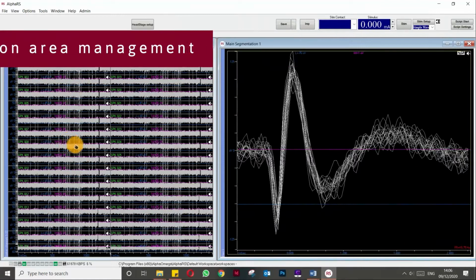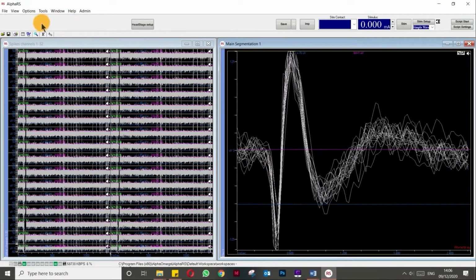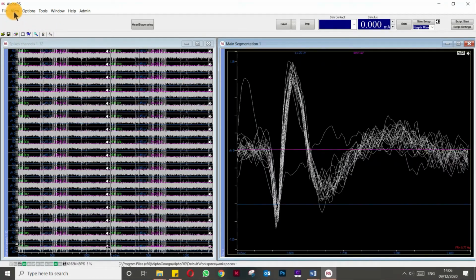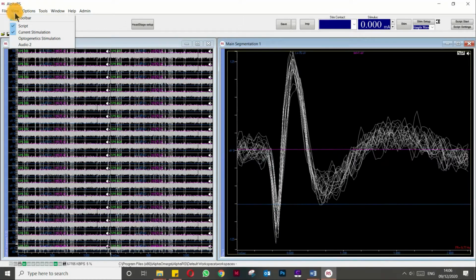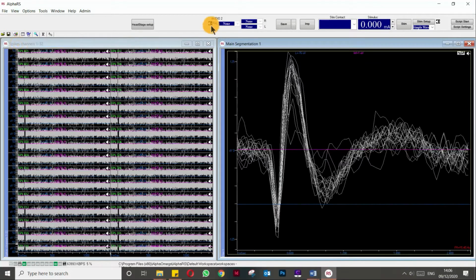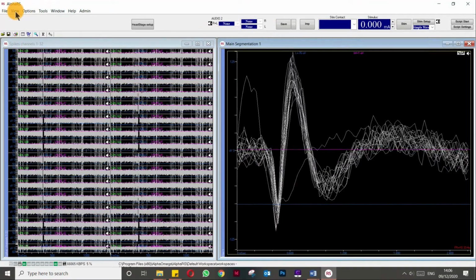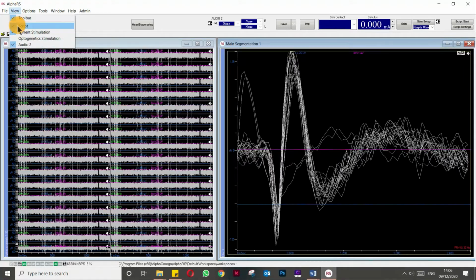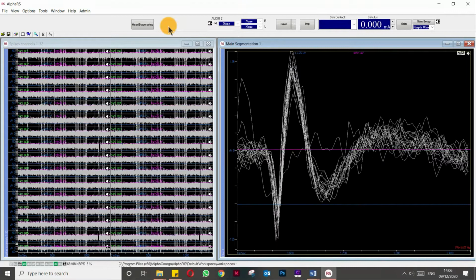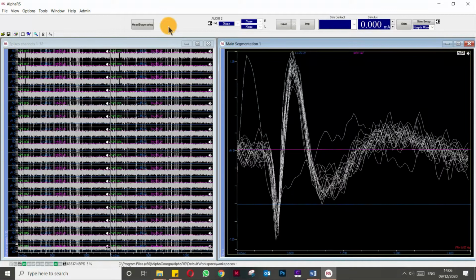Now moving away from the display area, the top side of the software is where we have all the setup options. For example, looking at the View tab, this is where we can control what appears in the ribbon. For example, if I was to click on Audio, I see that the audio setup appears, and if I was to remove, let's say, script, the script options disappear. So the view option allows you to customize which buttons to appear or hide in the ribbon area.